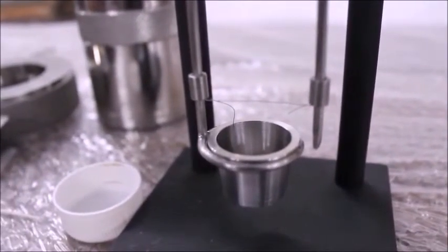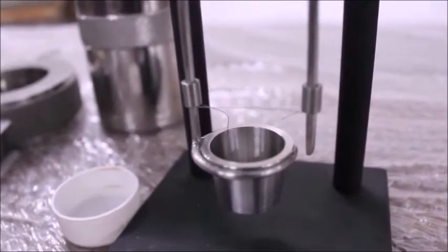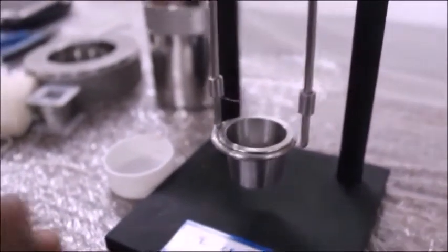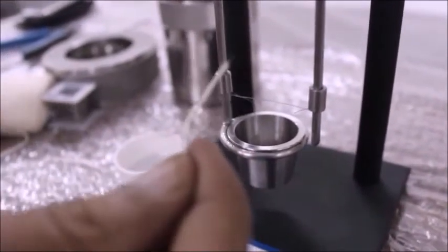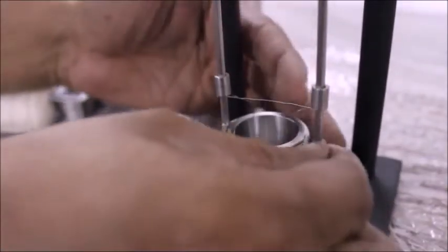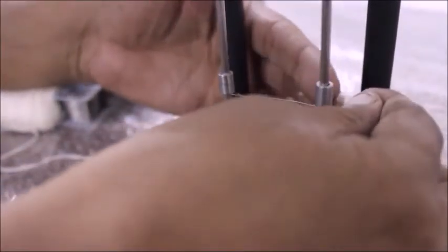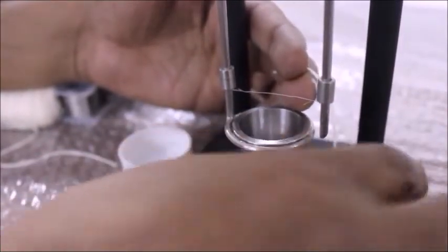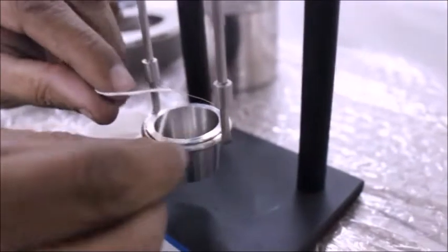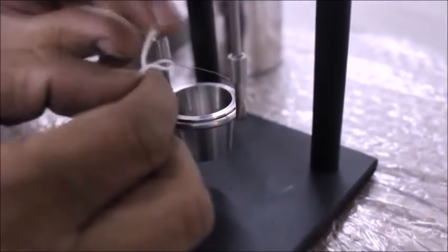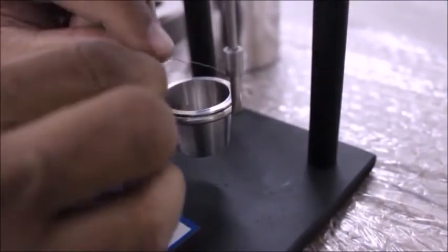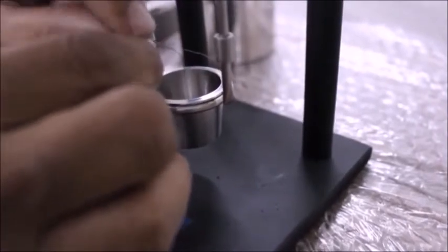Now take the cotton thread and tie a knot around the center of the wire. Make sure that one length is greater than the other.